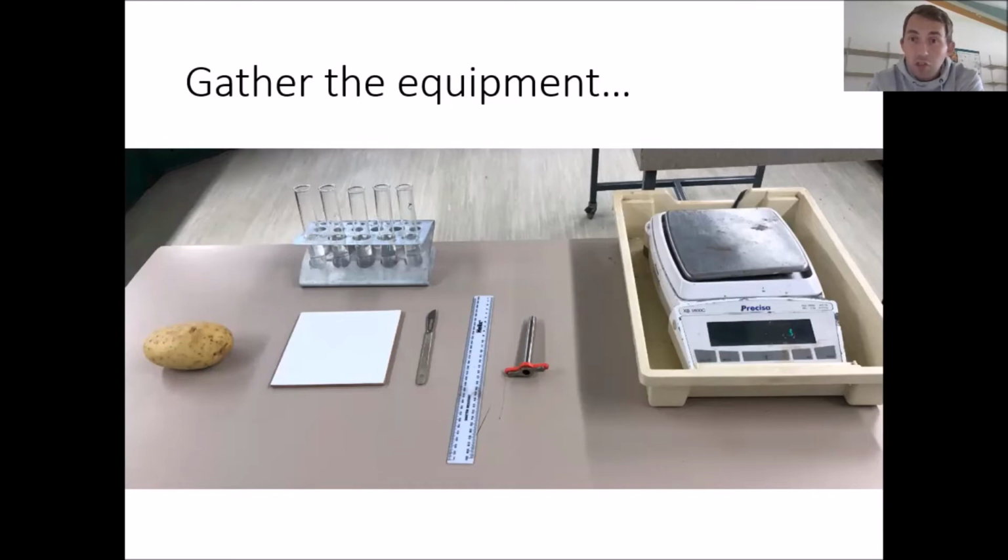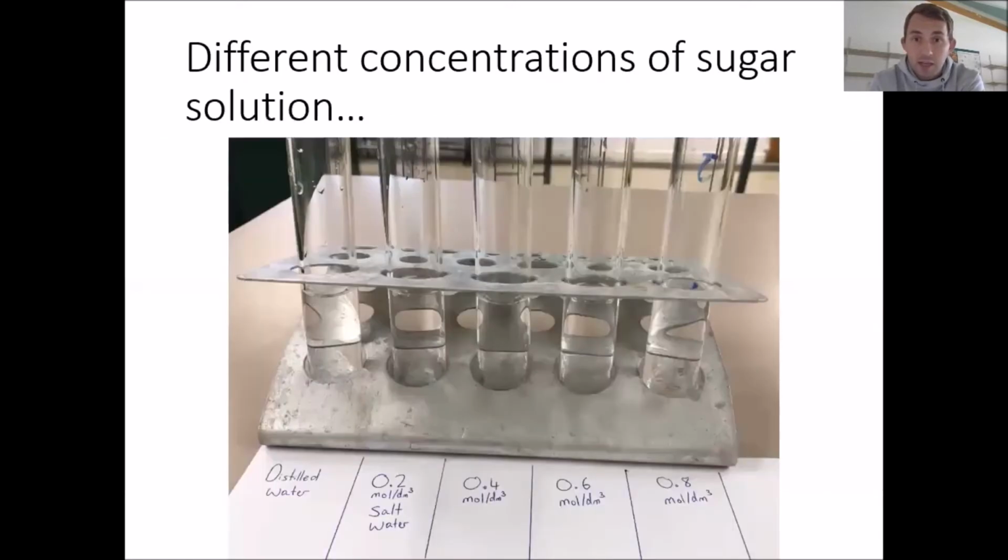So what I'm going to talk to you about now is how you do this with a little series of pictures that I've taken in my classroom today. So the first one to say, okay, is you need to collect different concentrations of sugar or salt solution. So what I've done here for you is showing you what you would do.